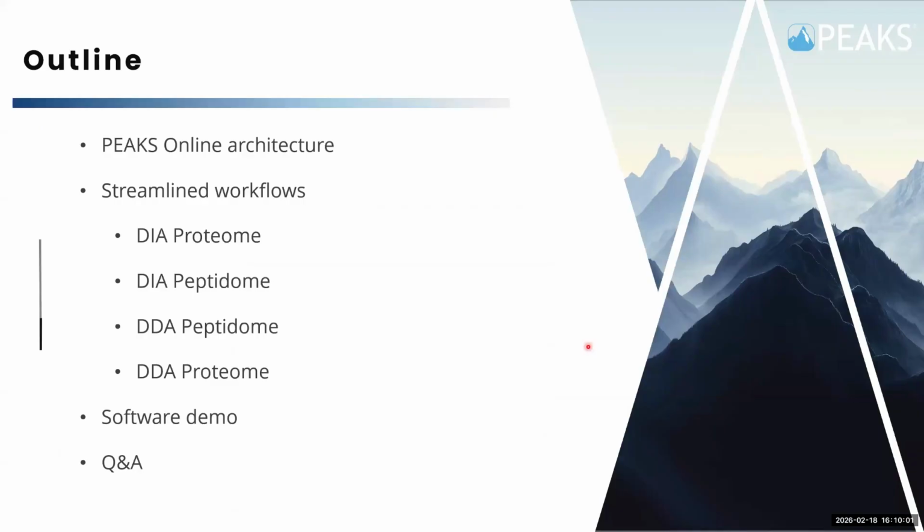So a bit of an outline for today's webinar. I'm going to discuss Peaks Online architecture. I'll also get into a little bit of our streamlined workflows, mainly focusing on DIA and DDA. However, I will be focusing more on the DIA solution and just touching a little bit on our DDA solutions. I will finish with a software demo, and then we will have a live Q&A, so if you have any questions, feel free to ask then.